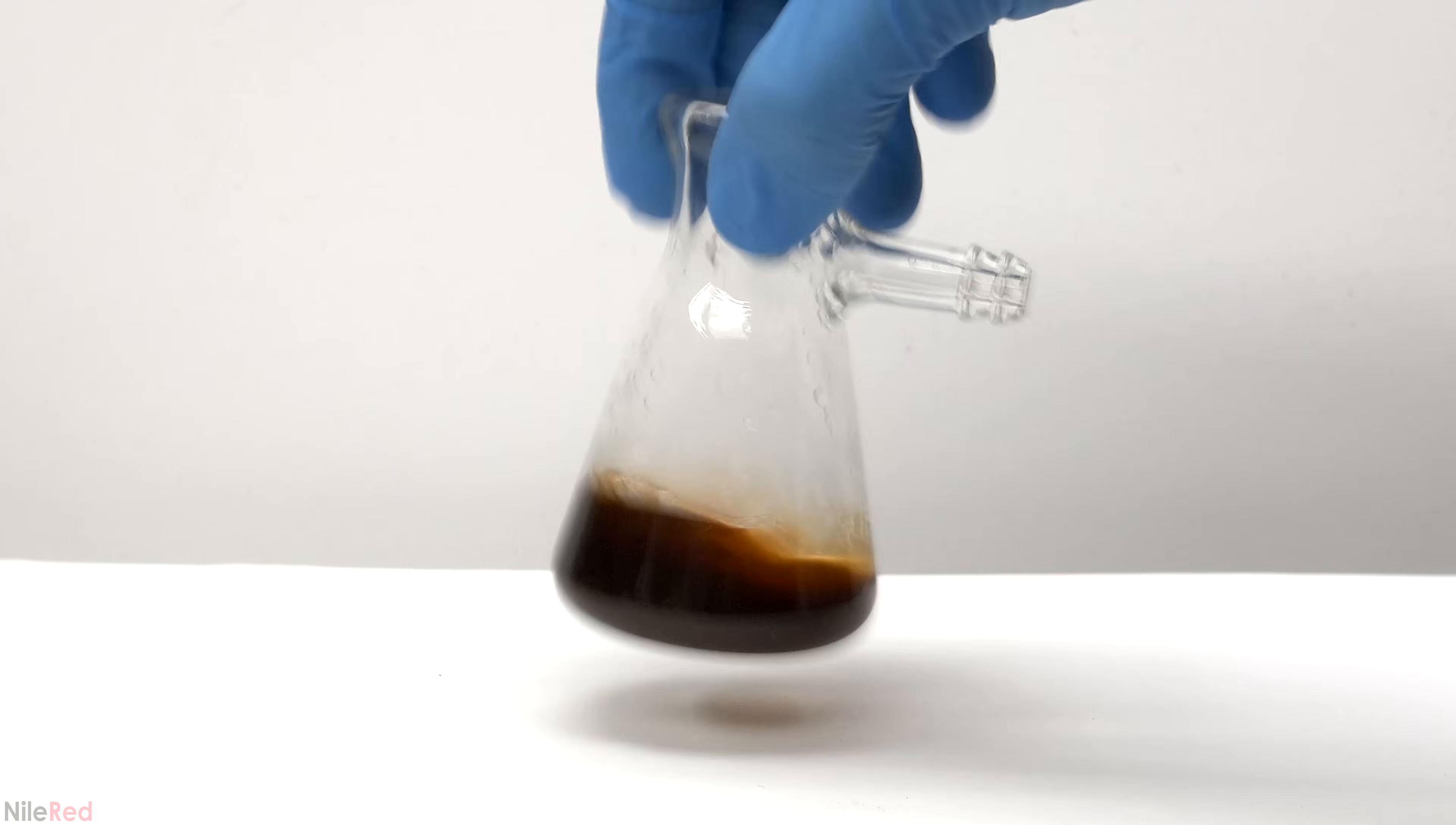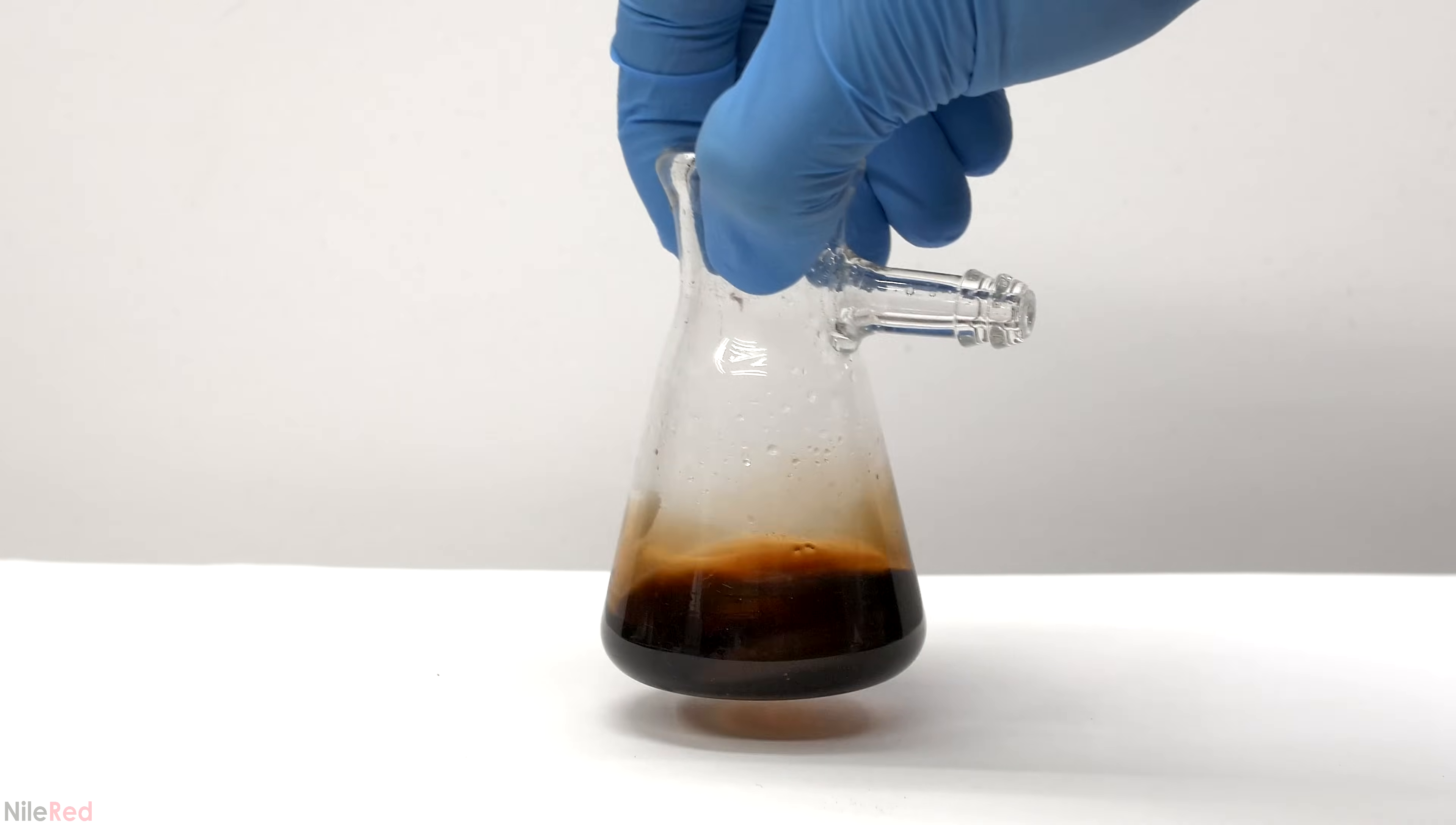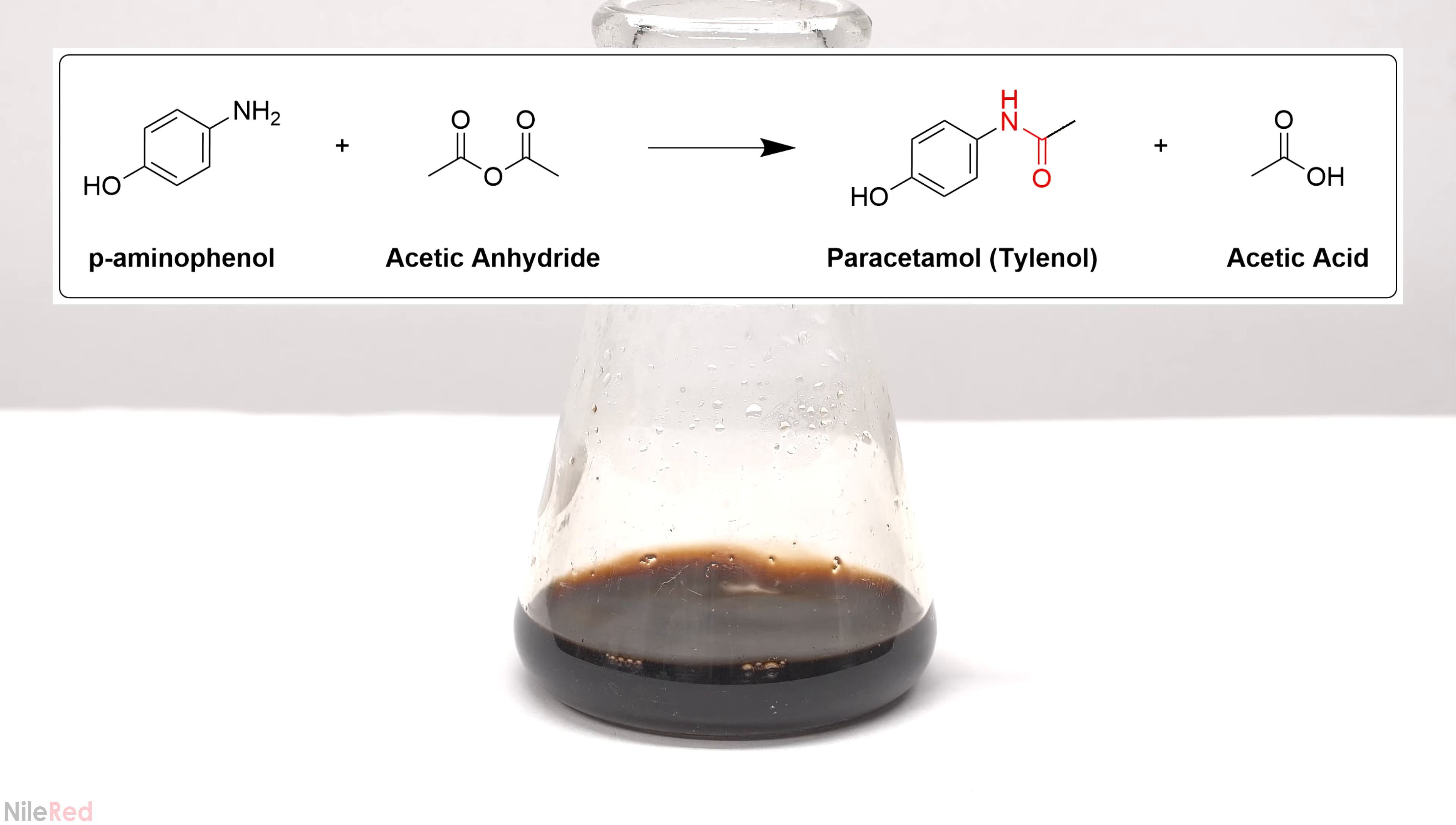I found that the stir bar wasn't doing a great job at mixing, so I decided to do it manually. The procedure said it would take about two minutes for a precipitate to form, but in my case it took about five. In this reaction, the p-aminophenol is being acetylated to form our final paracetamol.